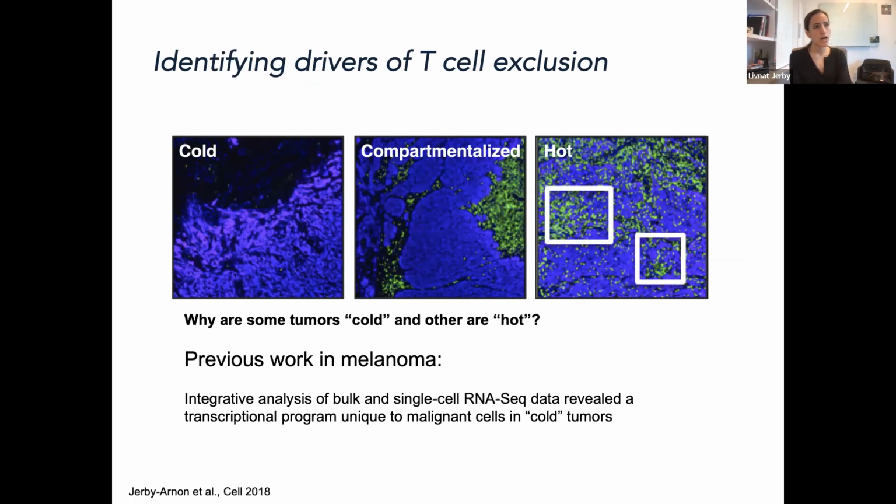And also, I think that there is value in reducing the search space based on associations and then following up on that. So I want to show you just one brief example, and this is from my postdoctoral work on melanoma, where we set out to identify the connection between cell states and tissue composition, particularly focusing on T cell infiltration and recruitment.